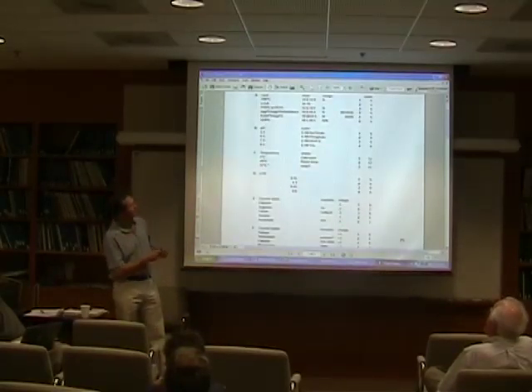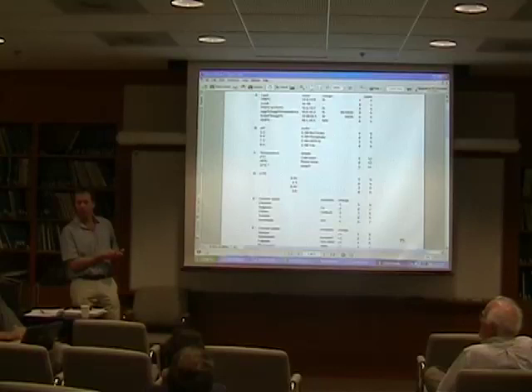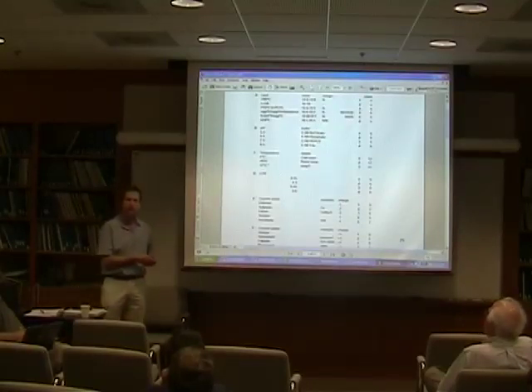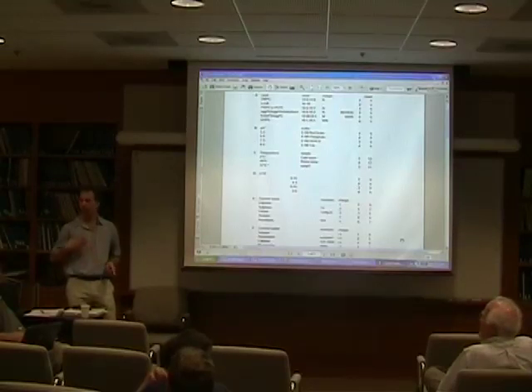So, are we happy now? Okay, we've changed that to phosphate for the buffer. We've done the lipids. We feel fairly confident with those things. So cholesterol is now an extra. If you take cholesterol, then I would also put sphingomyelin or other important lipids, which are uncommon lipids, into the category. Okay, sphingomyelin. Any others that should maybe be included?